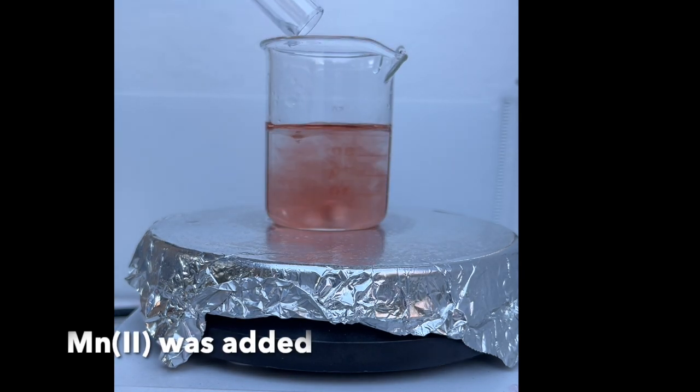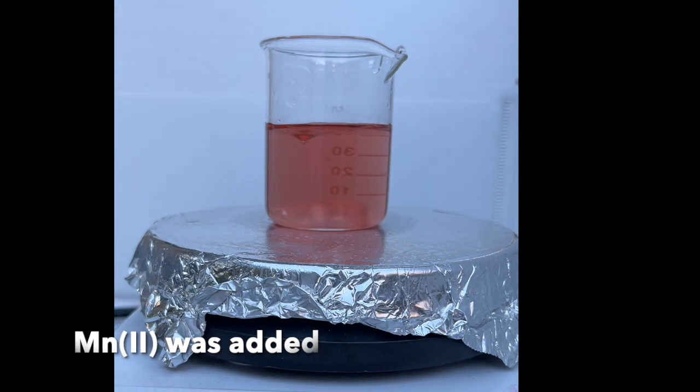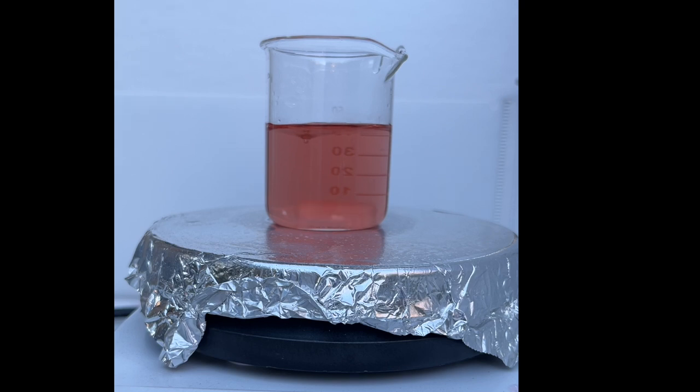Once it's fully mixed, we will add 1.8 milliliters of solution D, which is 10% manganese sulfate solution, which will be the catalyst of this reaction. Upon the addition of manganese salt, we immediately observe a color change. In the next 10 seconds or so, the solution slowly faded.